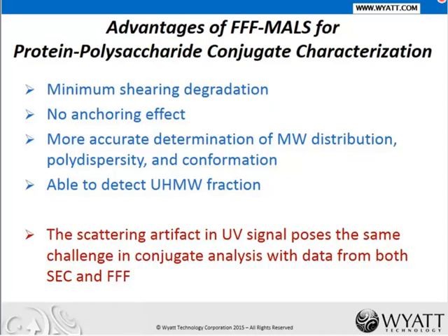I will caution that because of the scattering artifact in the UV signal, we will have the same problem whether the separation is performed by SEC or by FFF. But hopefully we will have a correction in our software soon, and I will share that when we have that correction.